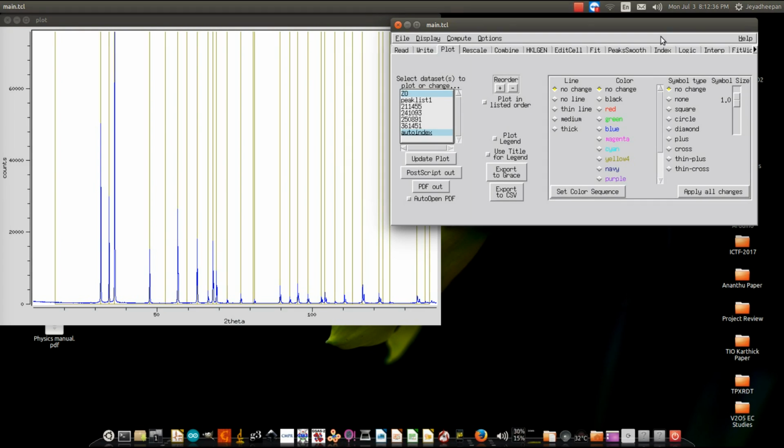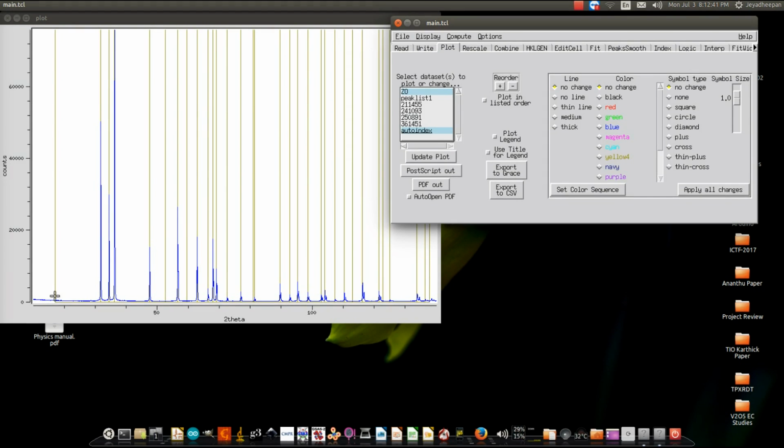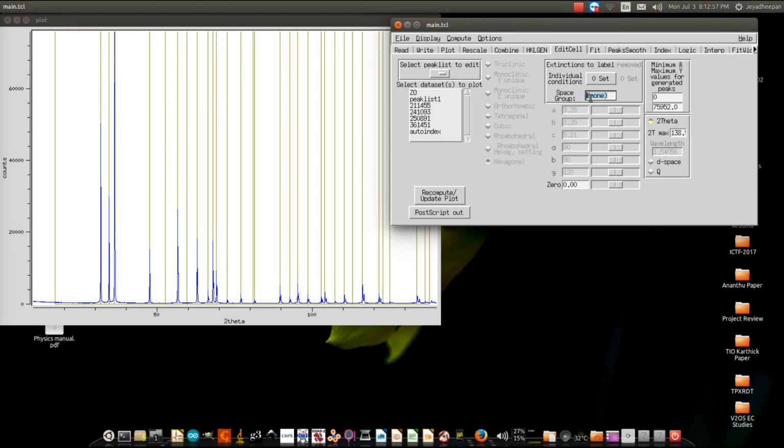Here it is, 0.0153. You just go through all the results; the error is here once again. So I am going to select the first one, this is 0.0153 as my result. And here, if you get some result, the selection parameter is figure of merit.